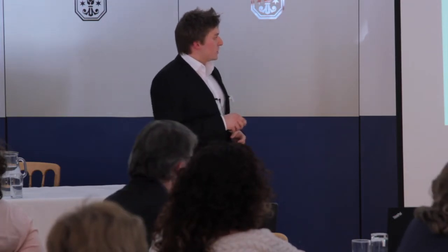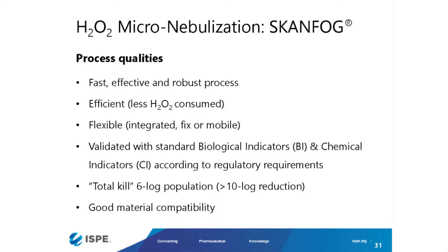If we look at the system, preparation, preconditioning, system startup, probably still needed, but then the effect is reached with much less hydrogen peroxide use. Actually, we use one third or even less of hydrogen peroxide than we normally use for our standard decontamination system. And we don't need to inject more H2O2 during the secondary phase of killing, which we now call dwelling.